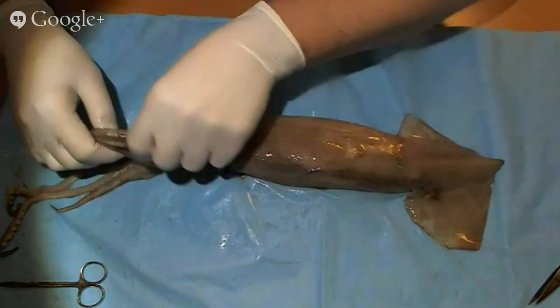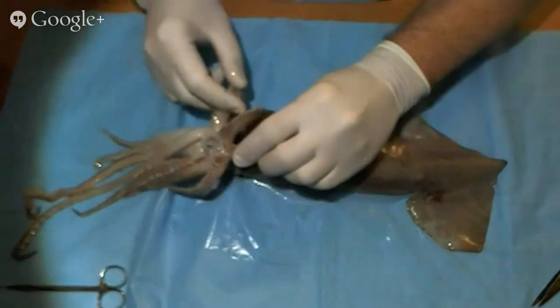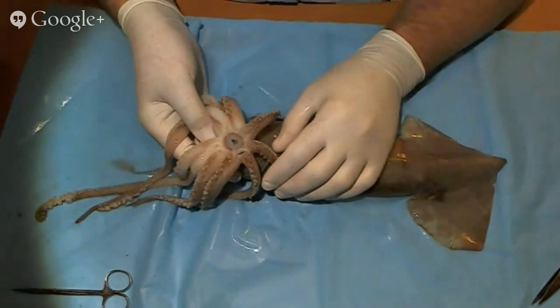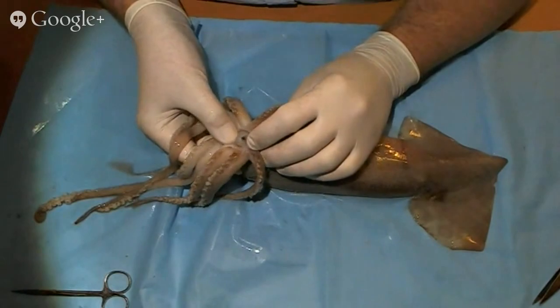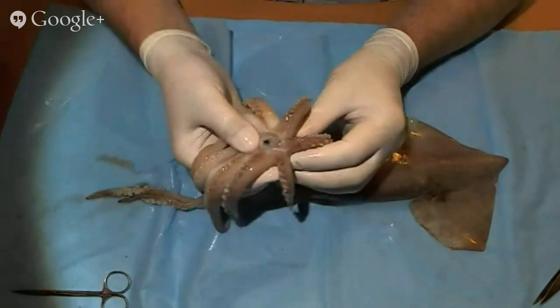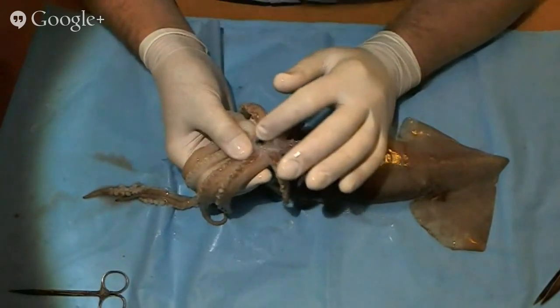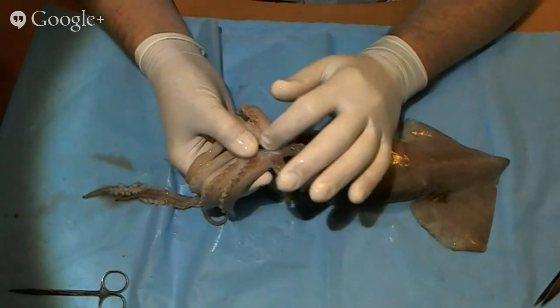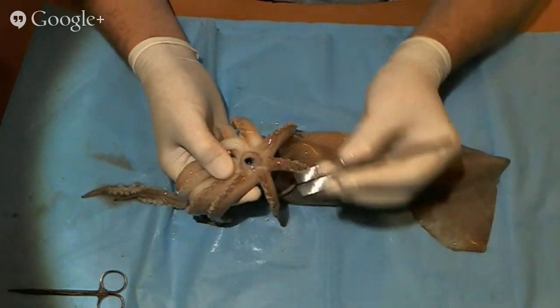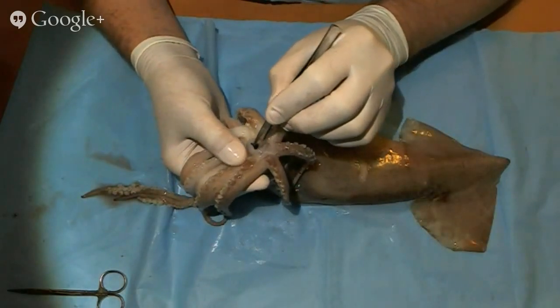All right, so if the kids want to see how it eats, what you have them do is you ask them about it, and then you can tell them that inside here, right down in the middle, they can see that the squid itself has a mouth in there. And they might say that, oh, look, there's something already in it. There's a fish, or you can ask them, well, what's going on inside of there? And then this is when you ask them to get out their tweezers or a dissecting needle and see if they can pull out something that's inside the squid's mouth.